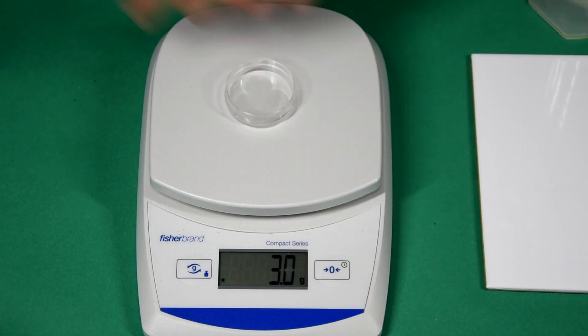We start by measuring out a number of weighing boats containing 0.3 grams of calcium hydroxide. Note the balance was tared at the beginning.